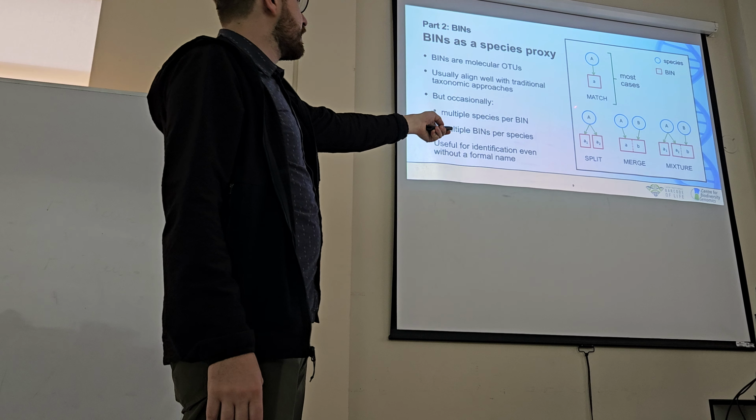If you want to search a different one, for example, you can just find a species that you want. Say you have a BIN that you studied, you just type BOLD colon ADT 0210. I hope it works.